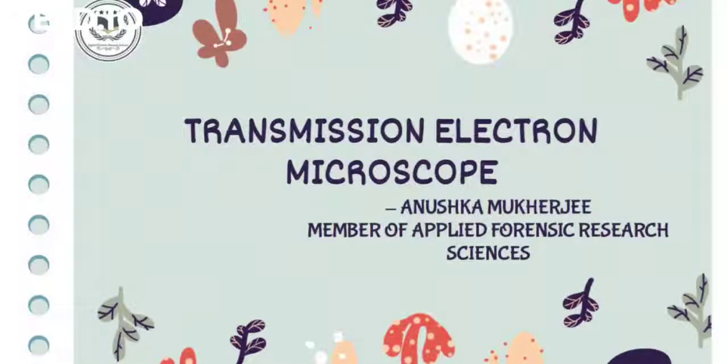Today we are going to discuss an instrument named Transmission Electron Microscope, which is also named as TEM. I am Anushka Mukherjee, a member of Applied Forensic Research Sciences.